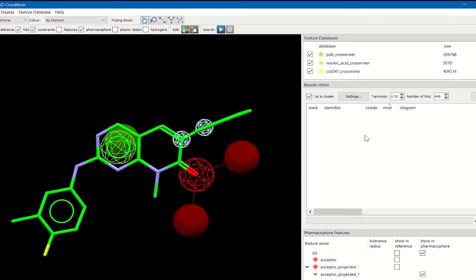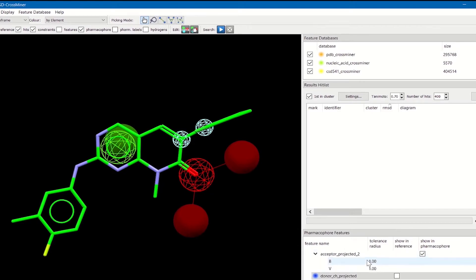Below this feature database window you find the results list that will contain information about the hits that are matching the pharmacophore query. On the bottom you have a pharmacophore feature window that contains all the information about the features used to generate the feature database.